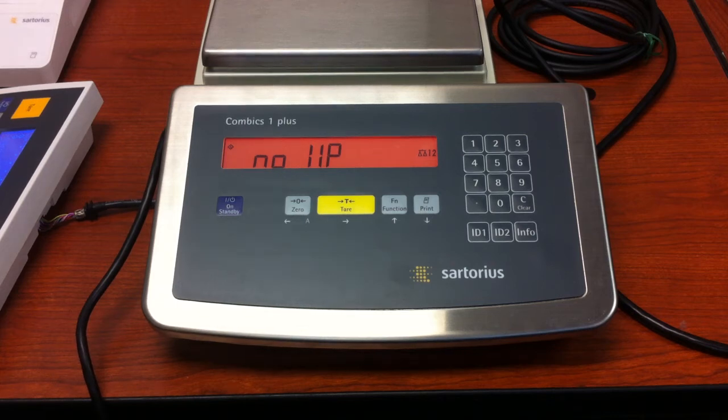This video deals with restoring your weighing point if somebody has gone inside the menu of the indicator and inadvertently changed one of the settings. If you have an IS platform or Satori's digital platform connected to an indicator with an RS-485 connection, we need to check the path to make sure that everything is set properly.